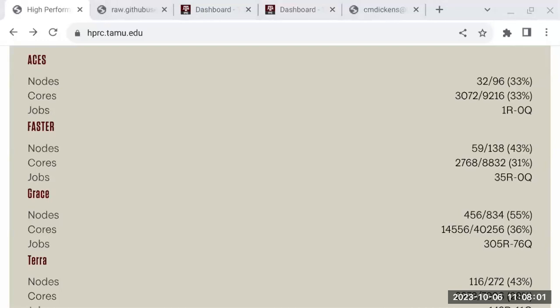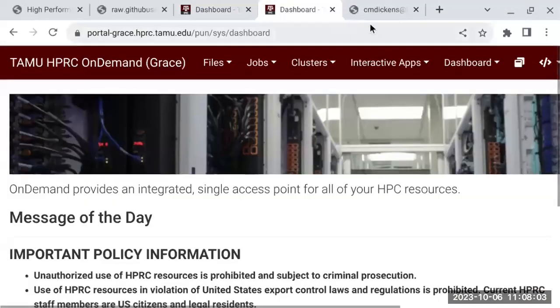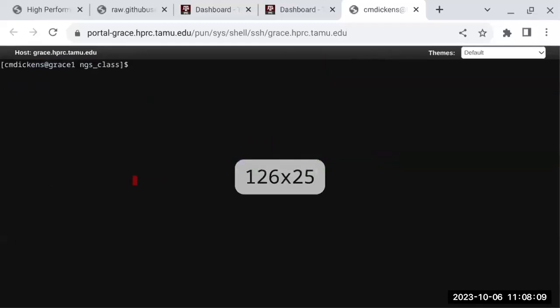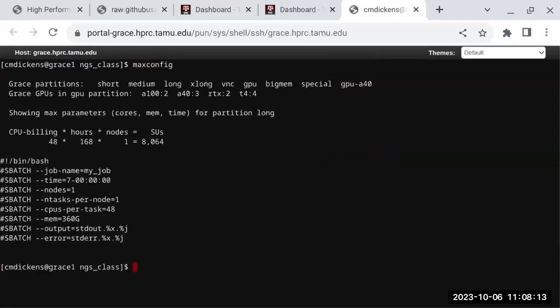This is useful because it'll give you all this information in one step here. It'll search other commands like sinfo. It'll also let you know if there's a maintenance coming up. If you were to submit a job script with these parameters, it'll let you know there's a maintenance coming up, and if you submit this job now, it's not going to run.